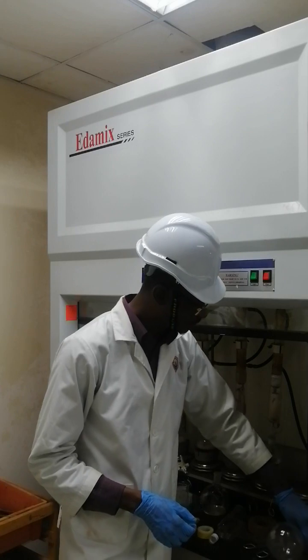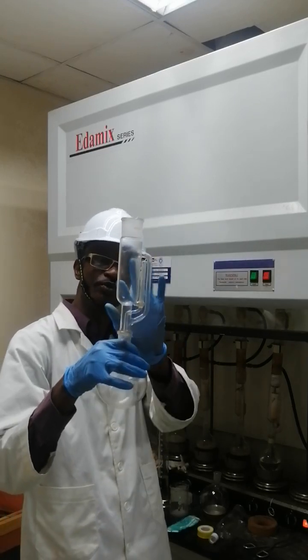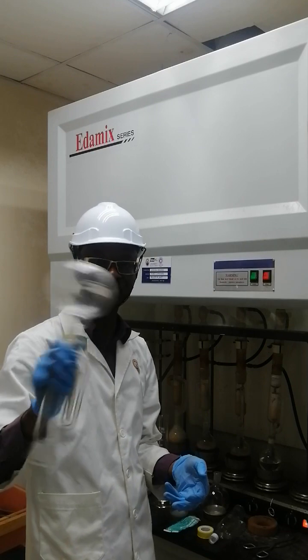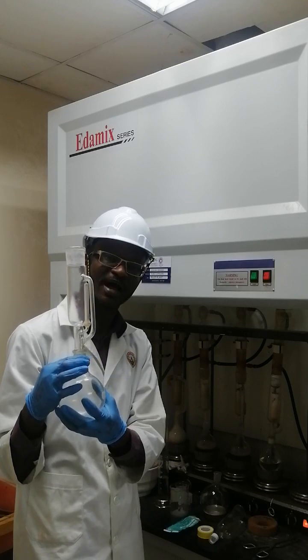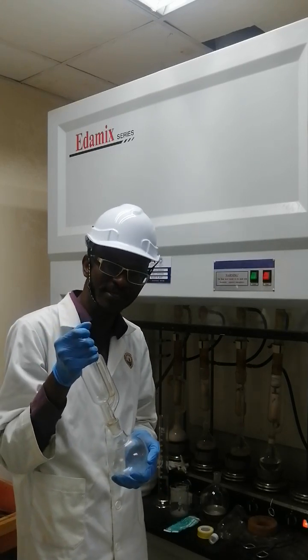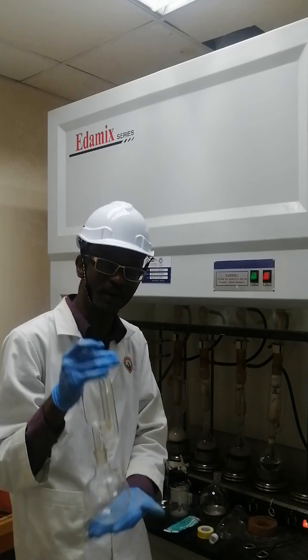If you look at this, you can see that the flask is sticking to the extraction chamber. In other words, the grinded joints are sticking together. We cannot remove it. At the end of the extraction, they are stuck together, and if you try hard to remove it, you cannot. If you try too hard, you may damage the equipment, in which case you lose the entire experiment and all the effort and the data that you have acquired up to this stage.